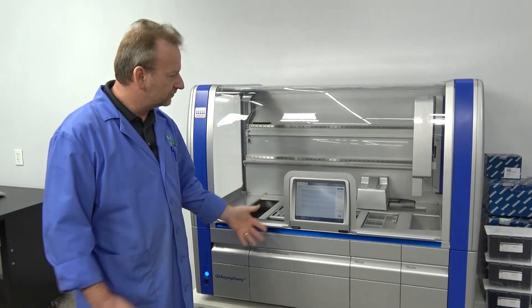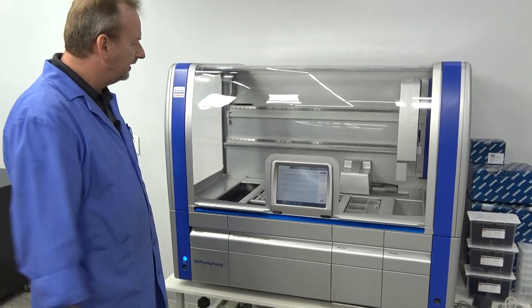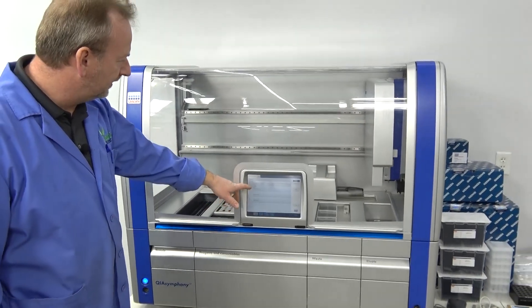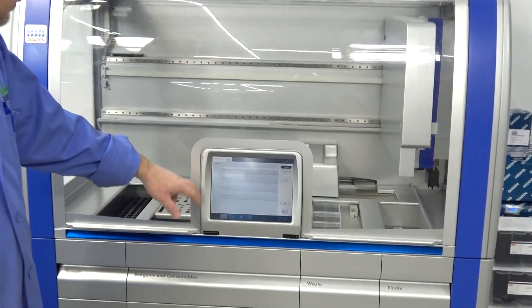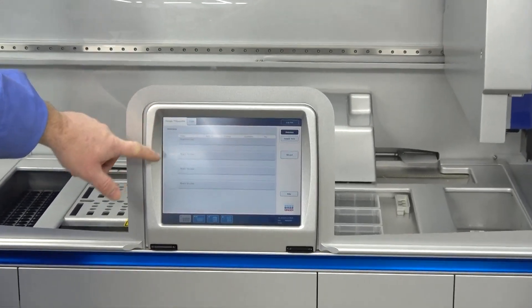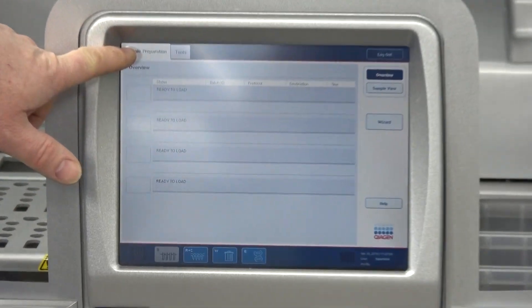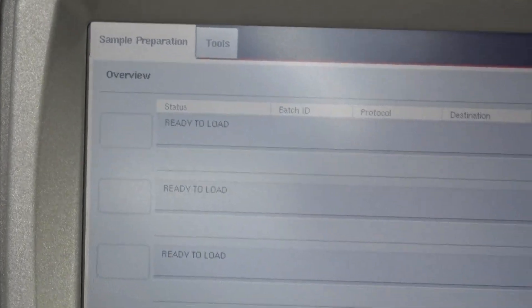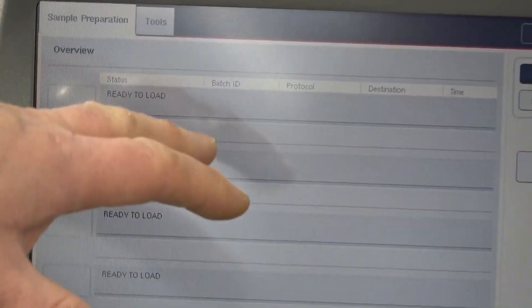We've actually logged in and it's gone through an initialization. It's ready to be set up and run. Right now I'm logged in as an administrator, which we have the password for, and you can see on the screen here we're at the sample preparation — this is where you'd really start your procedure and go into it.